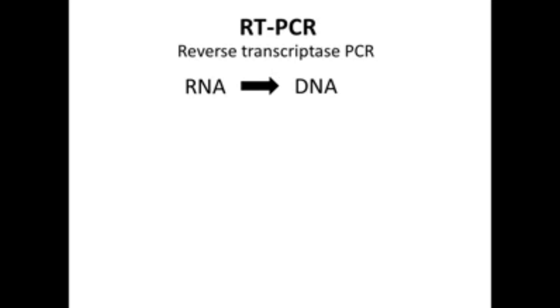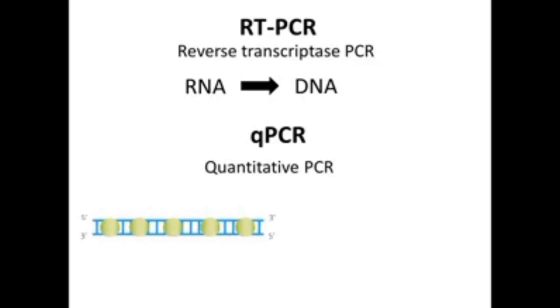The other PCR usually used is the qPCR, or quantitative PCR. In that, we use a fluorescent marker to measure the DNA quantity in a sample. We obtain this kind of graph in this kind of PCR.